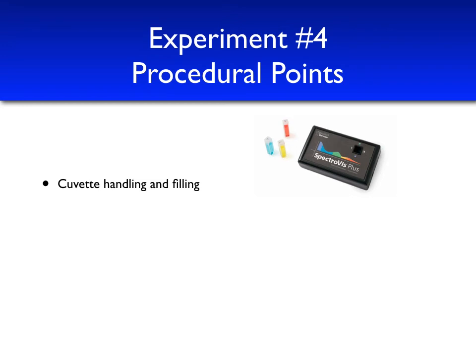Before putting the cuvette in a spectrometer to record a spectrum, we'll also wipe down the sides of the cuvette using a Chemwipe, which is a sensitive instrument wiper that will remove all fingerprints and excess liquid off the sides of the cuvette.